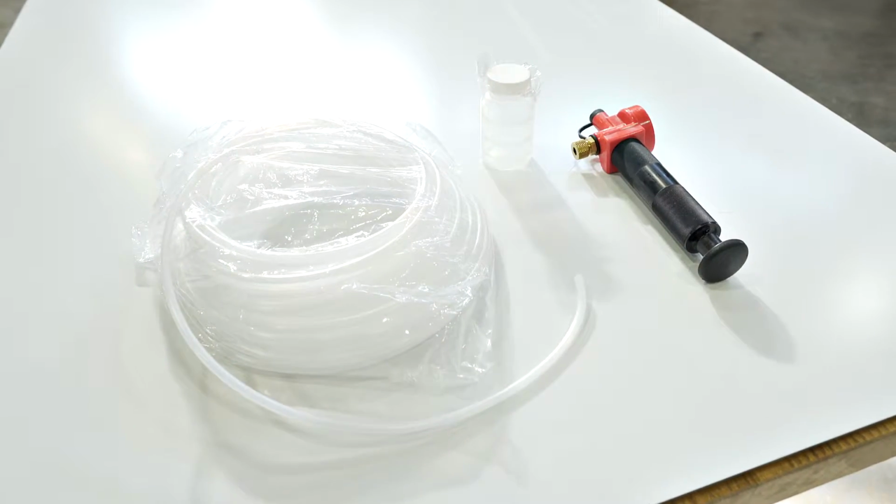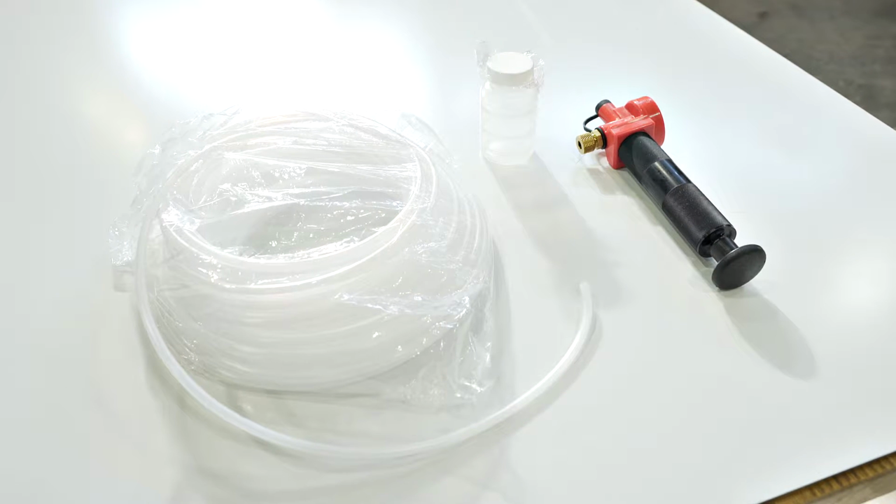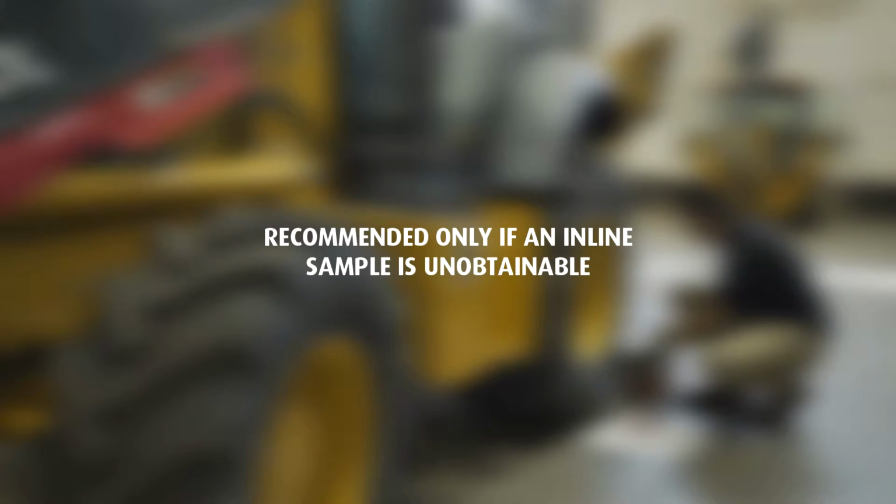Another method is pulling a sample from a reservoir or sump using the vacuum pump with tubing. Obtaining a sample from the reservoir is recommended only if an inline sample is unobtainable. The fluid to be sampled should be warm and circulated for 30 minutes in order to obtain a representative sample. Fluid in equipment that has not been operating and is cold allows information such as wear metals and contaminants to settle out in the reservoir.